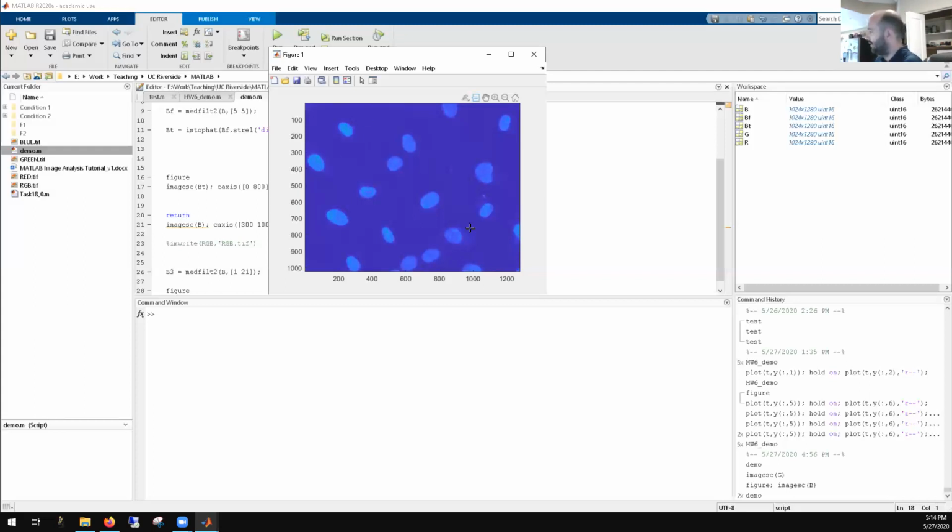So let's go to one of our dim nuclei. So this guy, for example, it's kind of dim, and we have an index of around 97. If I move to a brighter spot, 163, over here it's 95, 100. Now let's go to the background. Maybe 20, somewhere in the tens, in the single digits. So this background is significantly lower than our nuclei itself.